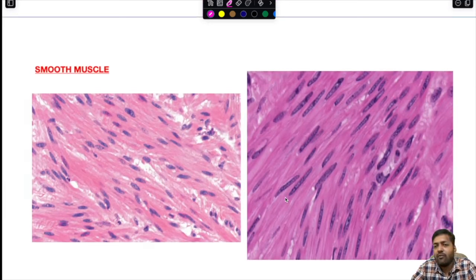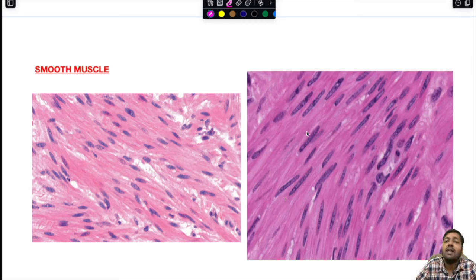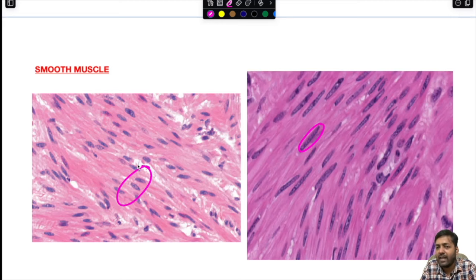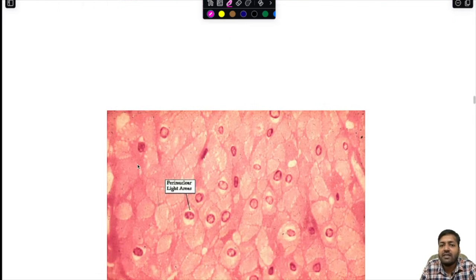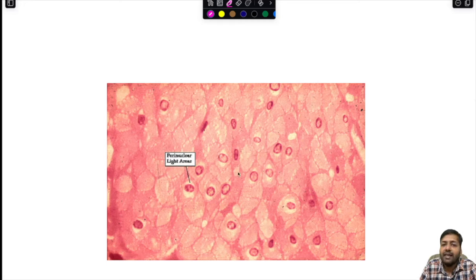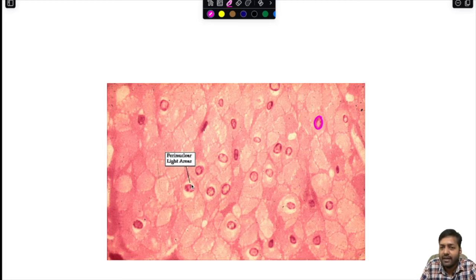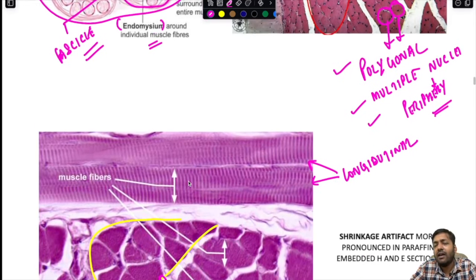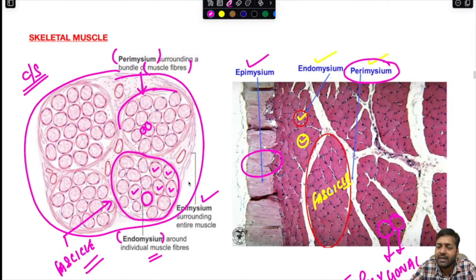For comparison, smooth muscles are spindle-shaped or plump spindle-shaped, with a single centrally located nucleus. In cross section, smooth muscle cells have a single central nucleus surrounded by a perinuclear light area. This contrasts with skeletal muscle fibers which are polygonal, multi-nucleated, and peripherally nucleated. We have already discussed muscle histology in detail during the basic tissue sections.